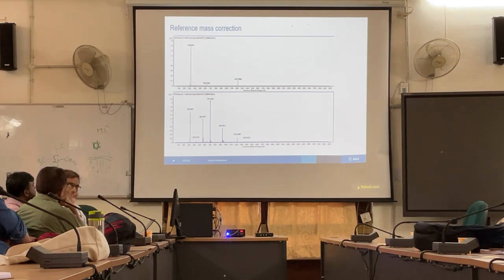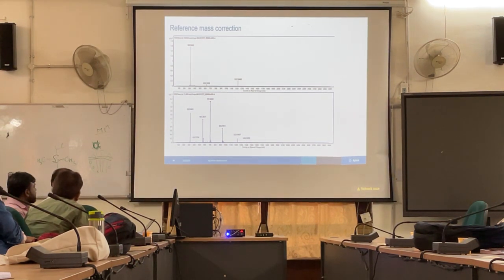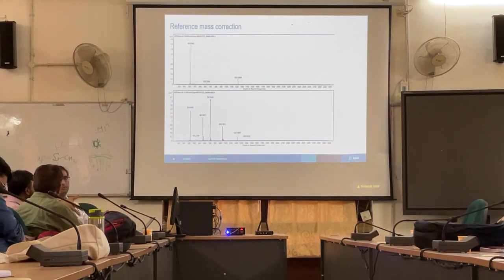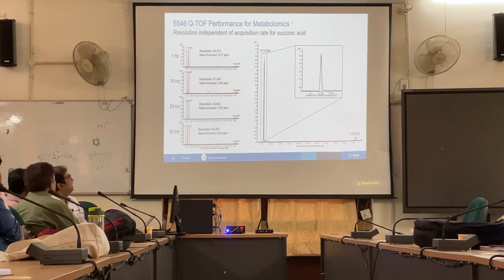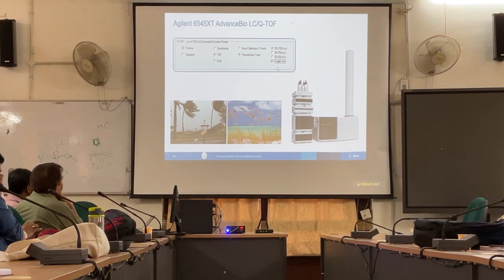And that is the reason we have designed this experiment. We will set up the method today and run overnight. We'll keep our fingers crossed that the run gets over, and tomorrow we'll see the data. Because you have replicates, minimum 3-4 samples you have to run. All this cannot be done in a single day, and you cannot do it with single runs. Okay? This is what we are looking at for metabolomics, especially.